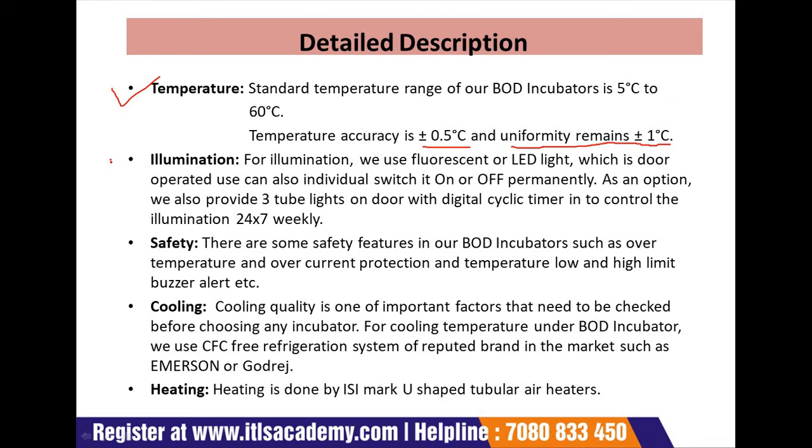Now we will discuss the illumination. For illumination we use fluorescent or LED light, which is door operated. You can also individually switch it on or off permanently.